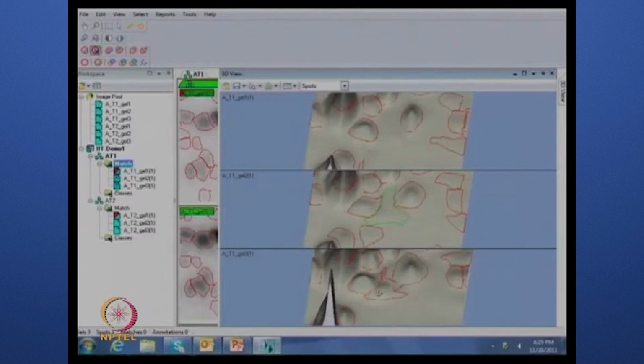Right. So I think sometimes it is possible that your treatment may have that spot appearing due to the upregulation of a protein, or it is totally shut down. But it is not the case exactly here, because these are all the 3 replicates of the same protein. So this should be the same, but somewhere it is not there, so we can delete these 2 spots here. Or in this case, I guess it is doubtful, so it is doubtful, or let it be.